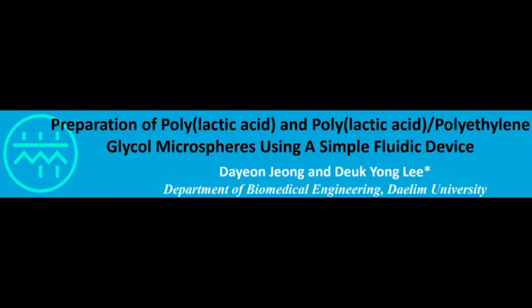The topic is preparation of polylactic acid and polylactic acid polyethylene glycol microspheres using a simple fluidic device. The goal is to create a delivery system with a stable pore structure to effectively deliver drugs into the body. It is made into particles so that it can reach the body, such as for cell therapy, by carrying cells through the formation of pore structures by wrapping the core material with a specific polymer material.